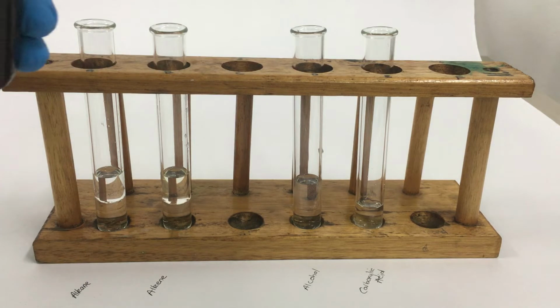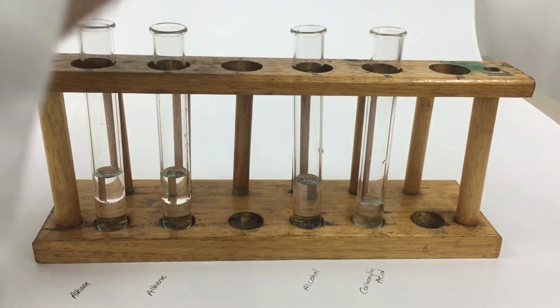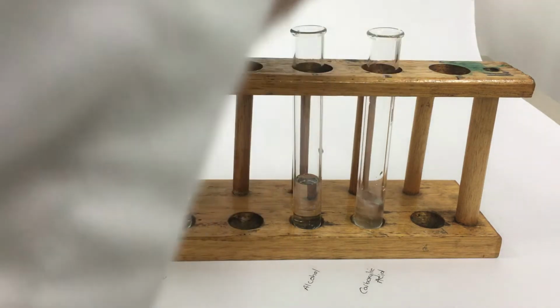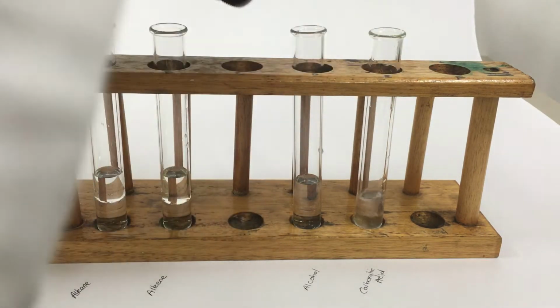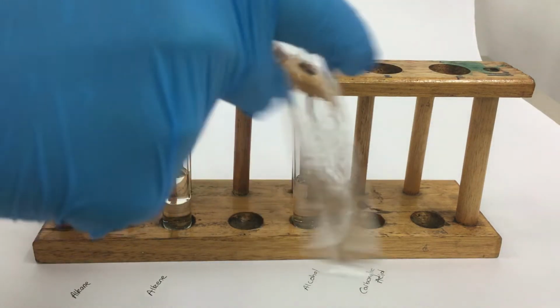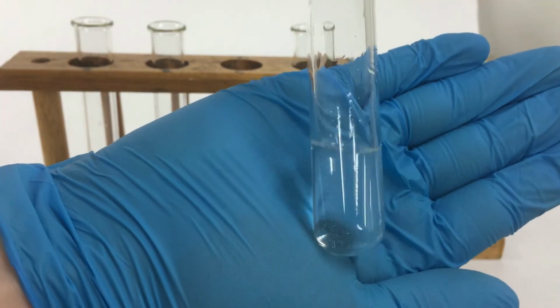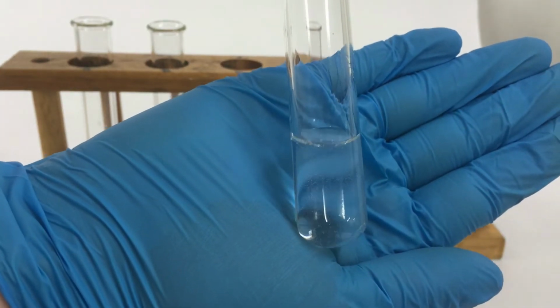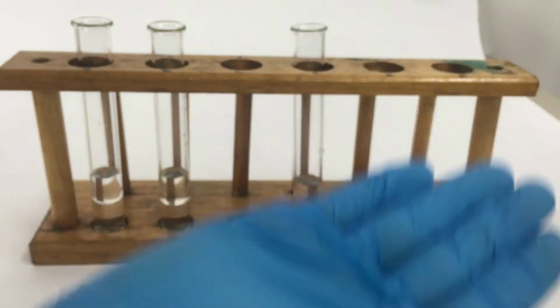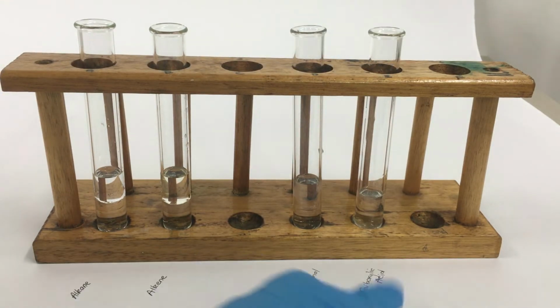And for the carboxylic acid, we've got acetic acid or ethanoic acid. Quite strong smell. And that's the same again, there's a few mixing lines in there, but that's gone into a single layer, so that's mixed together. So out of those, you have the alkene, the alkane, not soluble, and then the alcohol and carboxylic acid were soluble in water.